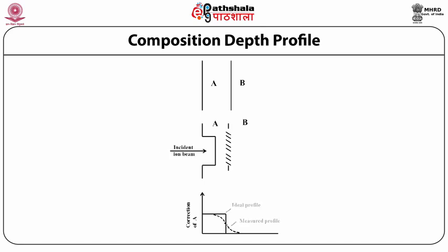For analyzing the depth profile quantitatively, it is necessary to measure the depth very accurately in addition to estimating the concentrations. Several factors need to be taken into consideration for analyzing the resolution of depth measurement, including the following two factors. First, the etching rate for every atom is not constant for identical ion beam energy and ion densities. Thus, preferential etching occurs for samples containing multiple elements.